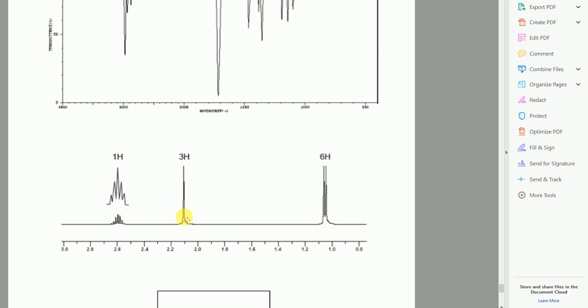So if I have 3 peaks, which it's a shitty graph right here, honestly. This kind of looks like 1 over here, 2 over here, and 3 over here. So 3 peaks, and then I subtract 1, and that gives me the number 2, and that means there's 2 hydrogens adjacent, okay? So there's 2 hydrogens on the carbon nearby. So that's the information that's given, okay?